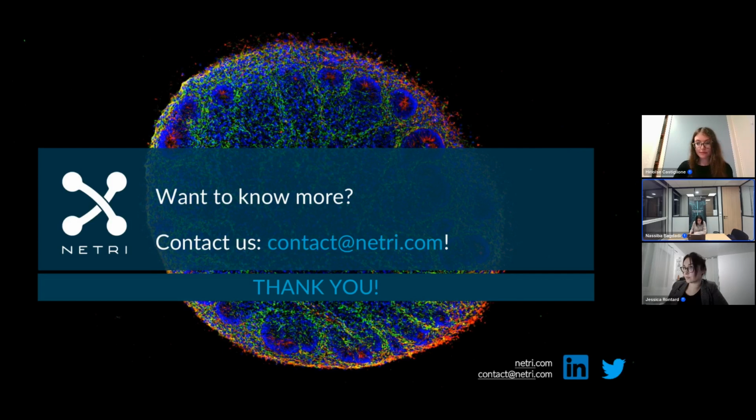Okay, so we have another question. Regarding your organoids in the chip, is there any improvement regarding apoptosis, necrotic core, or this phenomenon of vesiculation or cyst formation?